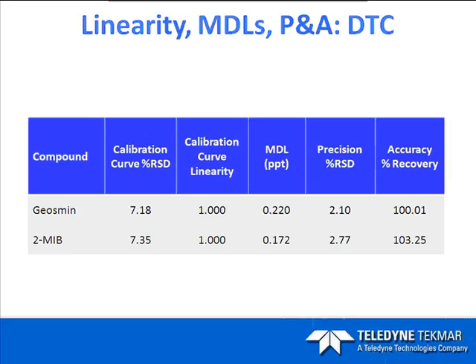nature. So in cryofocusing, I think for Geosmin it was 0.114, and for the 10 to 1 split, I think it was 0.123, and now we're looking at 0.220. So each one of these techniques is more a matter of preference, although we can definitely tell that we have increased the overall area counts using the direct column connect.